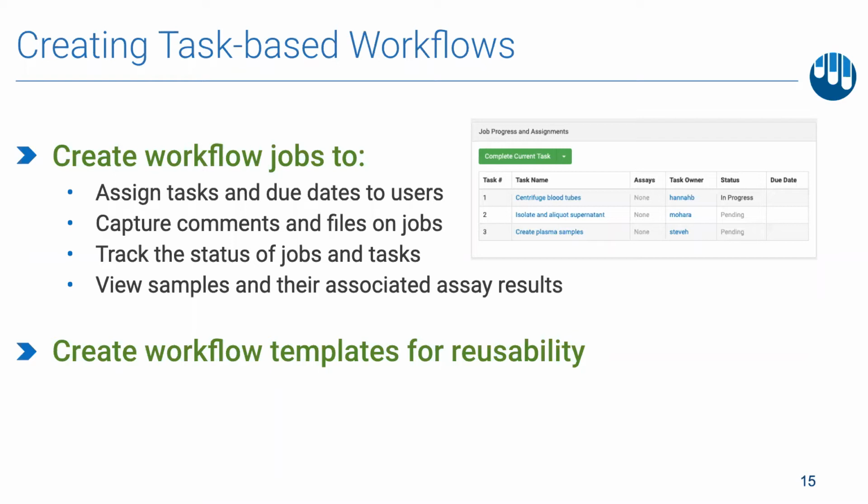Managers and teams can track the status of jobs and tasks, ensuring the right work is getting done at the right time. Workflow jobs will also show teams the samples and assay results related to that job, giving full transparency into the work. Scientists can always create an ad hoc workflow job to capture a given workflow, but for more standardized lab procedures, managers and other administrators can create workflow templates for teams to reuse.